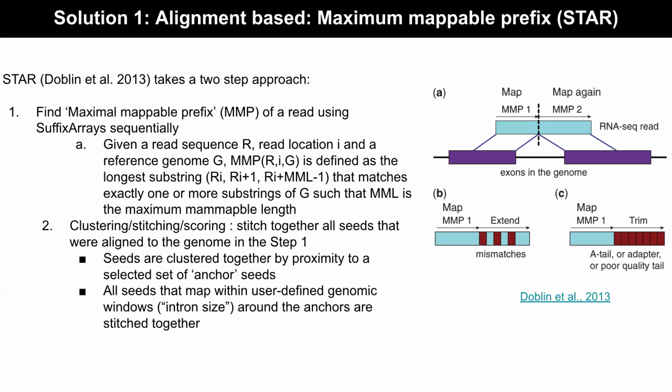Good question: how do you make sure it is not random? So the graph is able to build upon this idea. It takes into account, A, the error that you're calculating. B, this is not actually single-end data, it's actually paired-end data. I'm simplifying it, and that's why it looks like you will get a lot of errors. But when you start to talk about paired-end sequencing, that is a lot more exact.